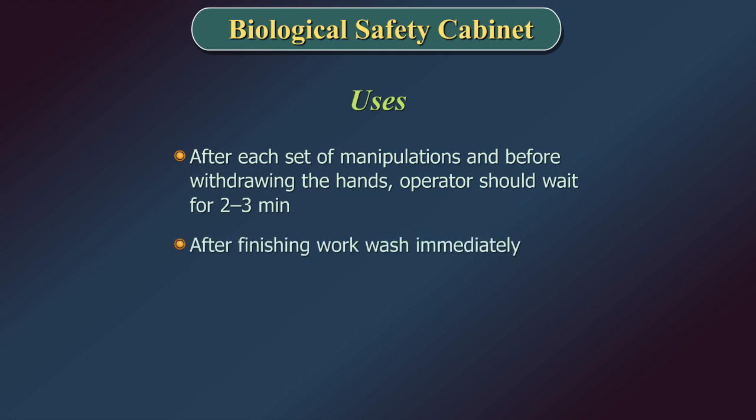After finishing work in a safety cabinet, the hands and arms may be contaminated and should be washed immediately.